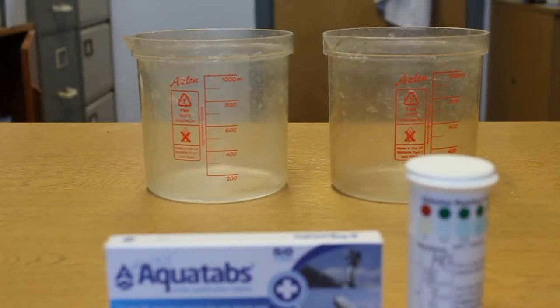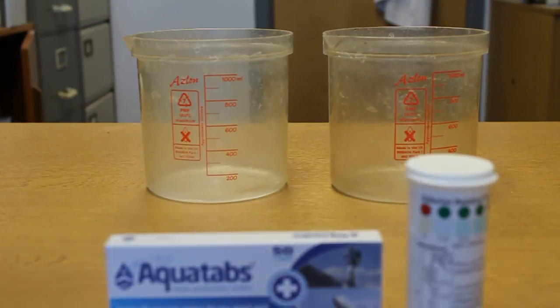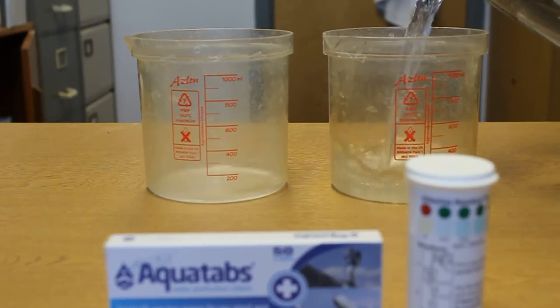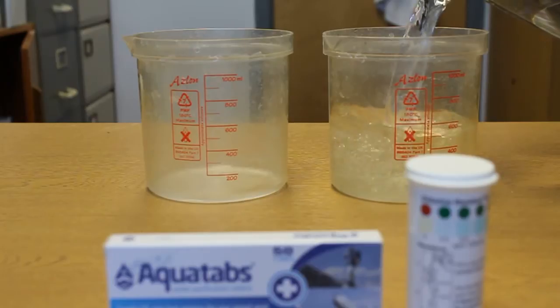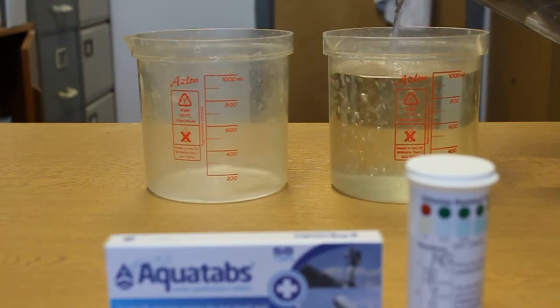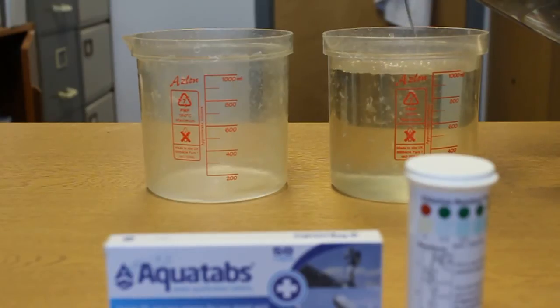The first thing you have to do is measure out a liter of test water sample. This water sample would be from the source that you intend to treat with the Medentech product, either Aquatabs or Aquacept. Fill the samples to the 1 liter mark.